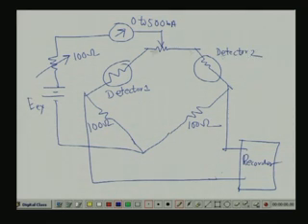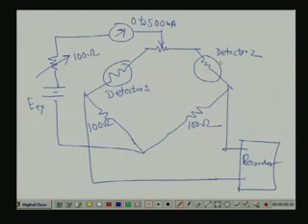Okay. So, the same carrier gas is passing through both the detectors. In both the cavities, cavity means actually we are showing that we can have 4 same sensors also. Okay. So, it looks like this. You see, this is the thing. Let me first explain, then I will go to that. See, two detectors are there. The same carrier gas is passing through both the detectors, but there is no column or anything on detector 2. Initially, I will balance the bridge by varying this potentiometer.